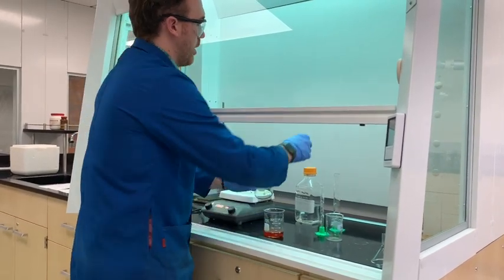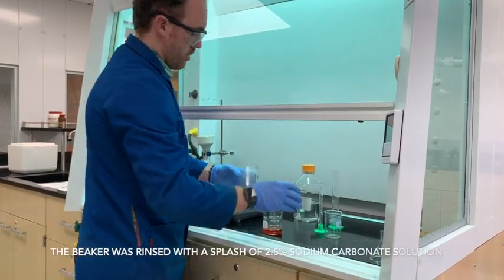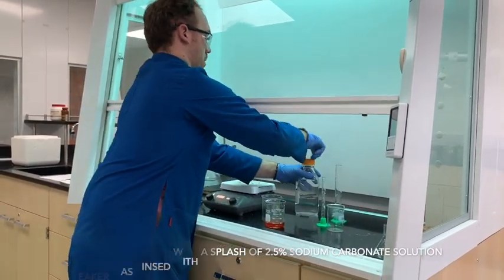I'm going to rinse this with a little bit of sodium carbonate solution. Just a splash.